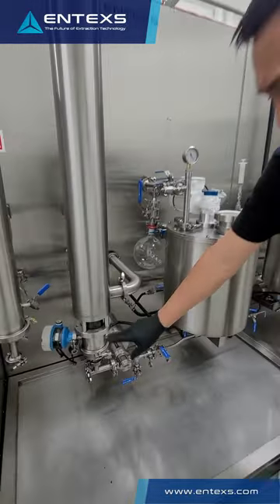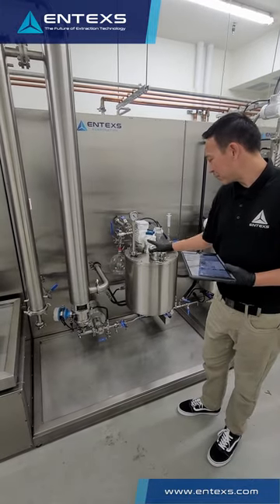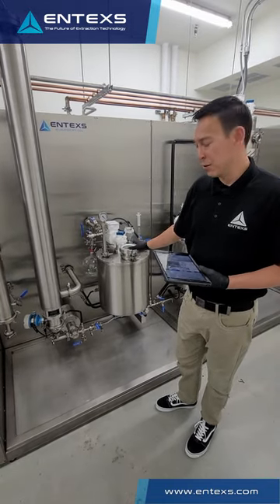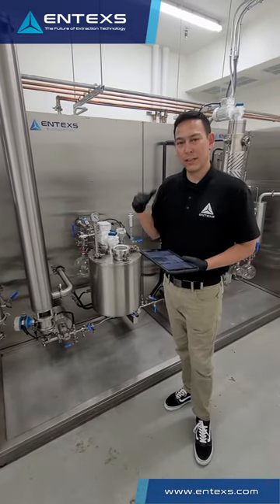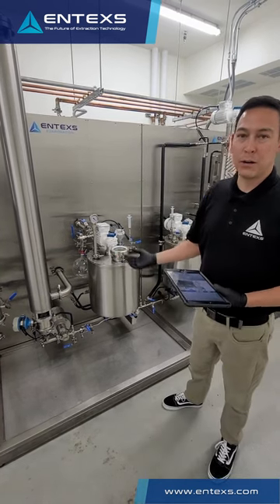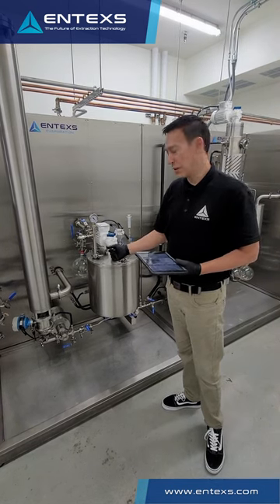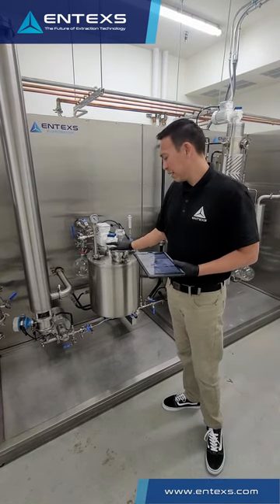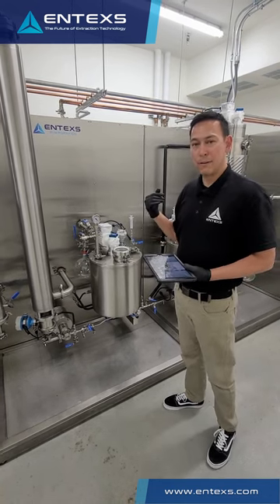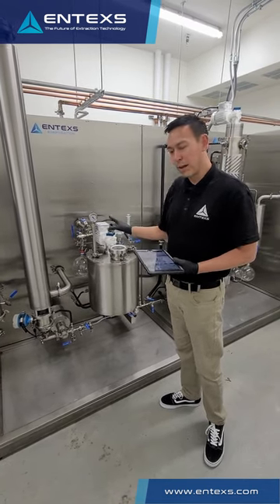What we do with this is send it over to a desolvent decarb tank. This reactor utilizes heat, agitation, and vacuum to remove residual solvent, getting it down below the acceptable threshold for solvent levels, and it also decarboxylates your product. So you're left with a full spectrum crude oil after this piece of equipment. If you're running hemp, we can also remediate with this piece of equipment, so you can off-take a THC-free crude oil directly from this process.